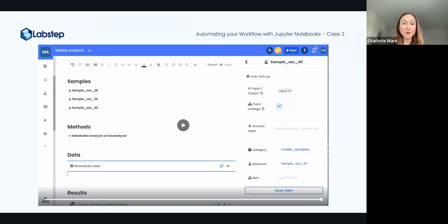Your other question about languages. Yes, in Jupyter Notebook you can run other languages. At the moment, we just support Python, but if anybody is particularly interested in running scripts in other languages, for example, if you've got a load of scripts in R or something like that, please get in contact with us. It is feasible that we could add other languages, if there's demand for it, this is something that's possible for us. Great, thanks for letting me know.